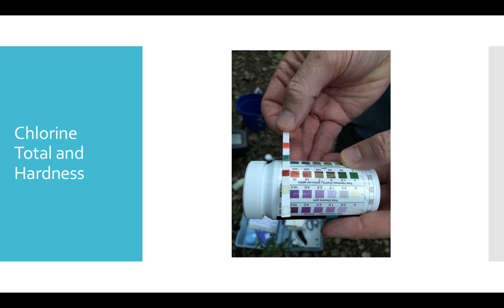So we did some observations of those out in person, and then I went through and ran all the chemical tests. I'm going to go through our results for chlorine and hardness, nitrogen, pH, and the other things we found. It'll give you an idea, and I'll talk about each one, what's high, what's low, and what different things should be, to help you out a little bit.